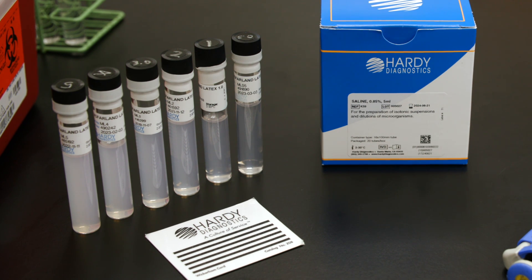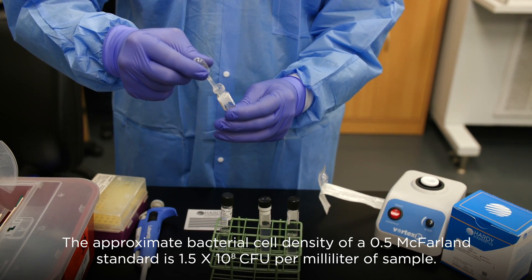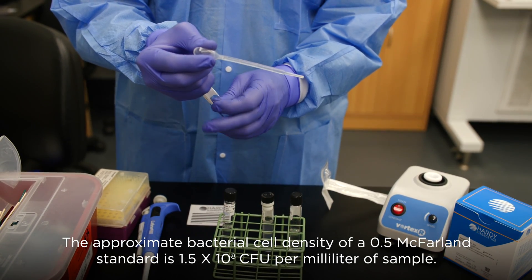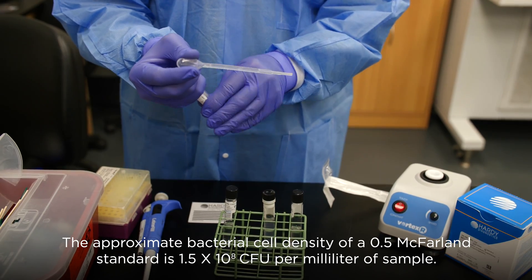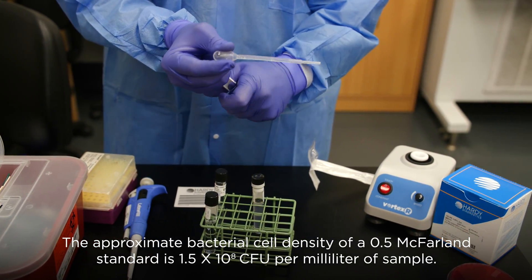The approximate cell density differs per McFarland standard. The approximate bacterial cell density of a 0.5 McFarland standard is 1.5 times 10 to the 8 CFUs per milliliter of sample.